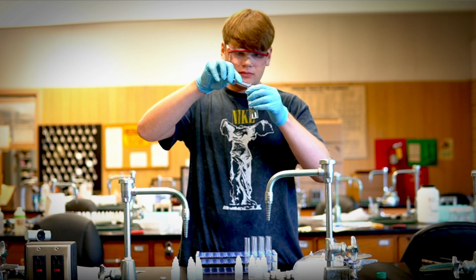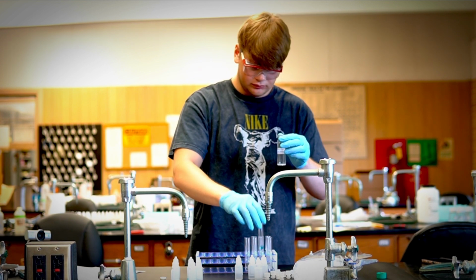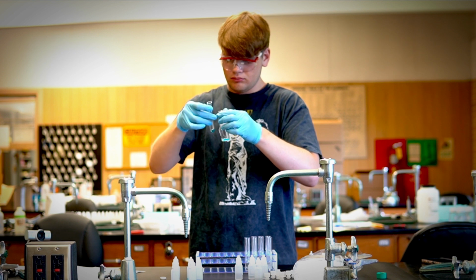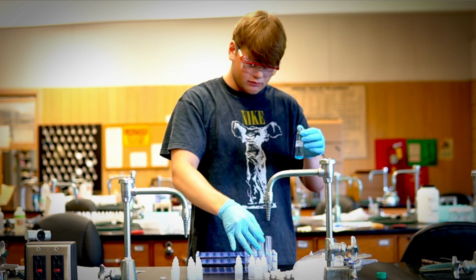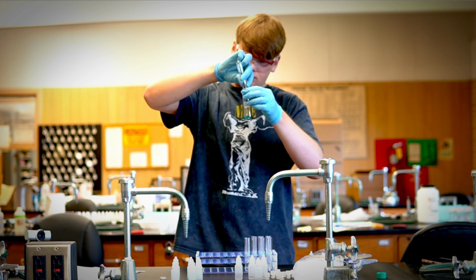You're going to pour everything in there. We're not going to pour it into the sink. We're going to pour it all in there, and you're going to return this. We're actually going to use this waste beaker for another lab as well. So make sure that you keep it, make sure that you seal it well, and make sure, as always, that you are staying safe.